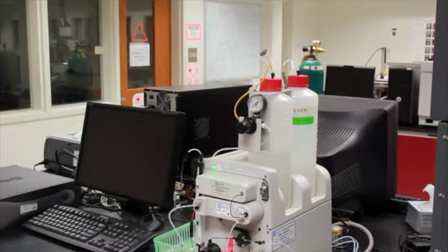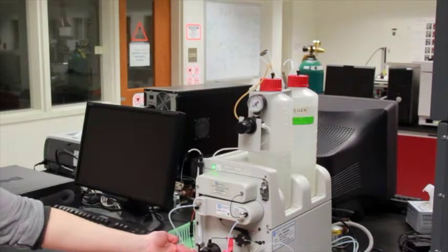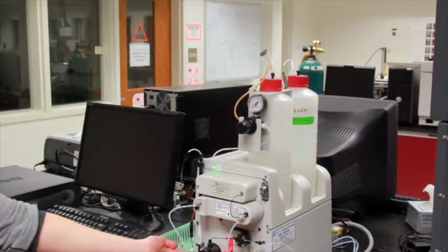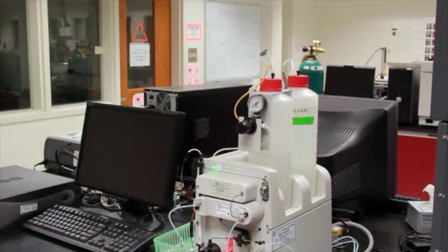The knob that you use to prime the pump is the little black knob on the mixer off to the left. When you open that knob, you only need to give it half a turn. If you keep twisting the knob, eventually it will come off, and that is not good either. While the knob is turned, so it's open, you will need to check the flow rate to make sure that there's liquid coming out, and we'll show you where that is in just a second.